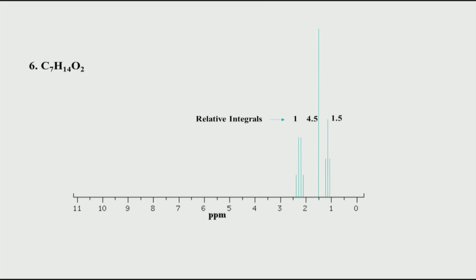So, what comes to our mind which will satisfy this particular condition is basically like this. It could be a C which is attached to 3 methyls, and therefore none of these methyls are coupled to any protons. You can see here that these 3 methyls are isolated, because this C does not have any hydrogen.